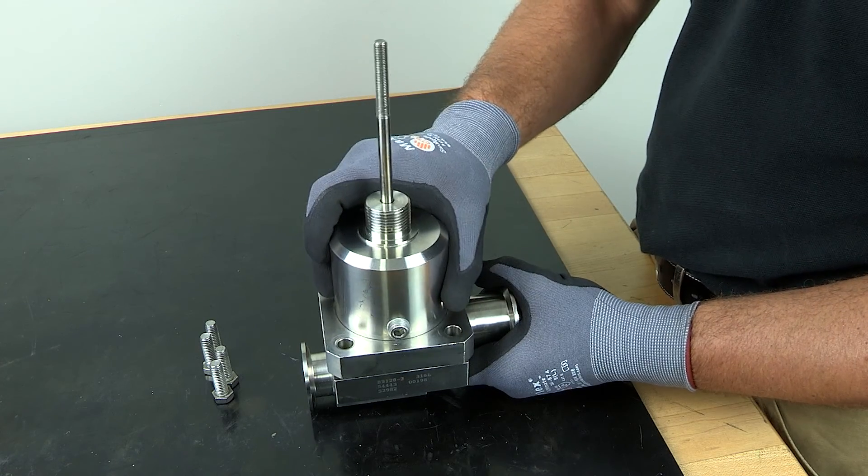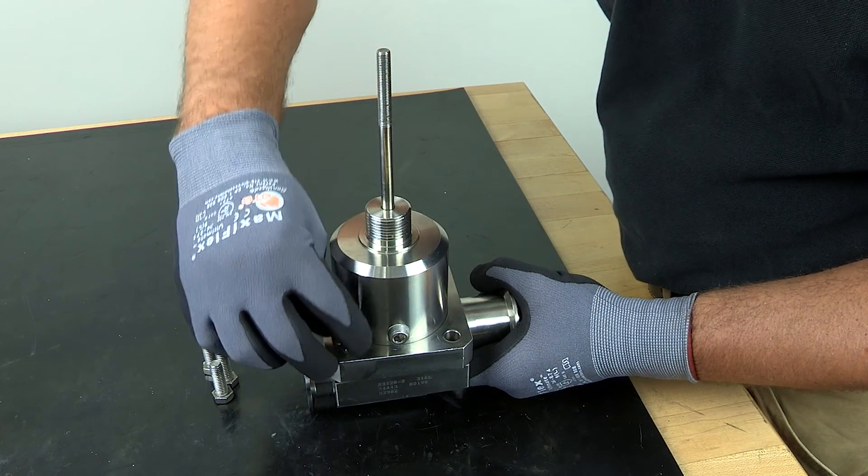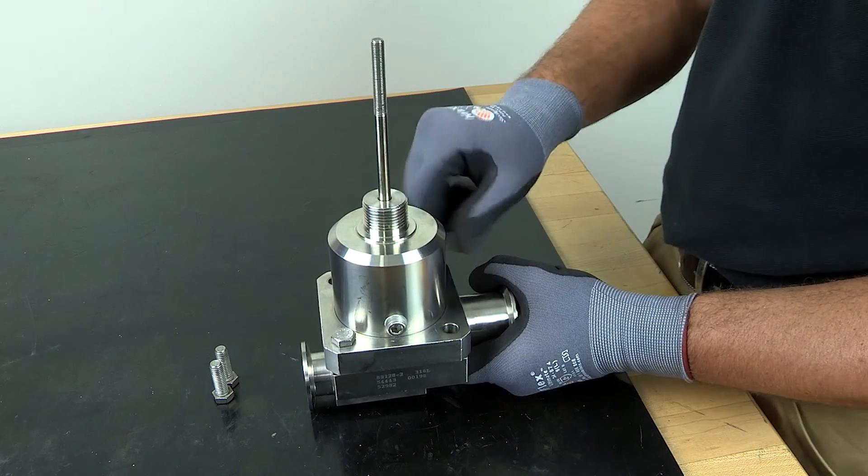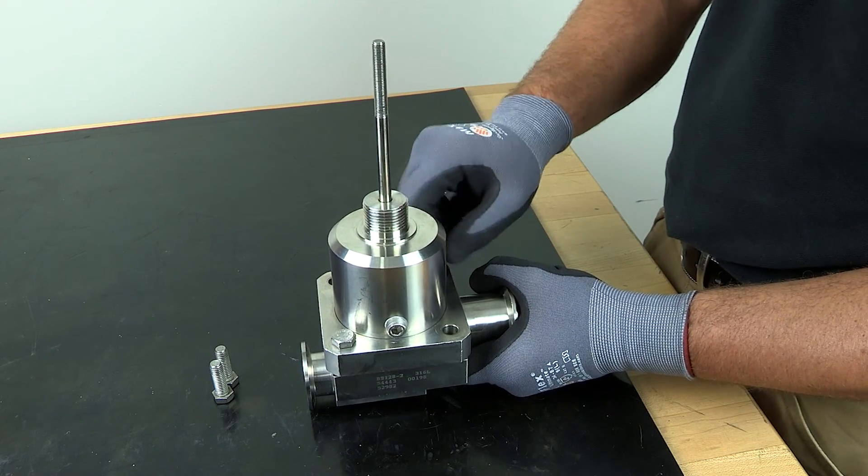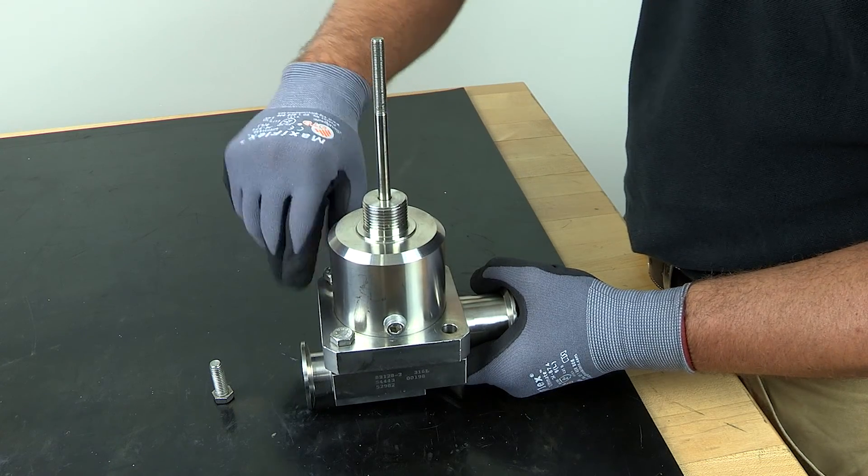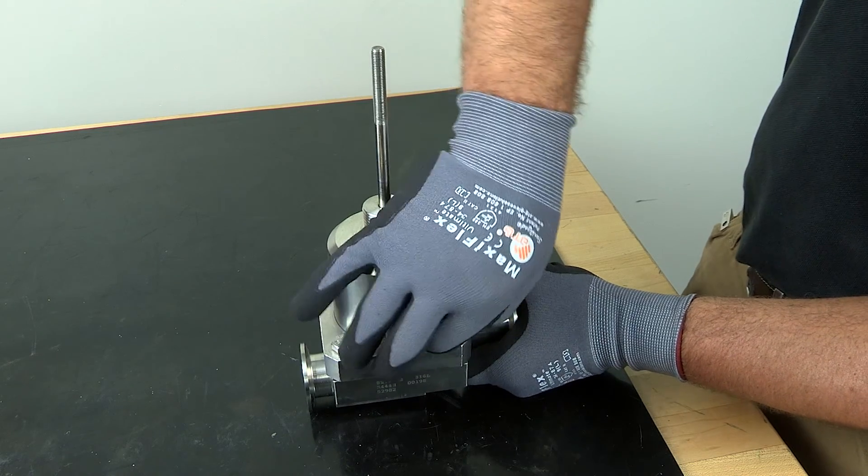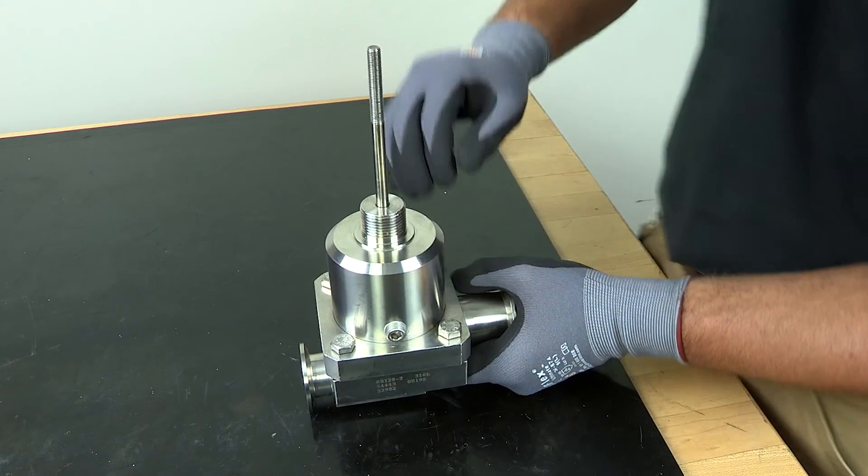With the O-ring and diaphragm in place, the entire assembly can be added onto the valve body. Clamps or a flange are used to attach the bonnet to the body. Make sure you tighten everything evenly to ensure the diaphragm is evenly sealed between the bonnet and body to create an aseptic barrier.